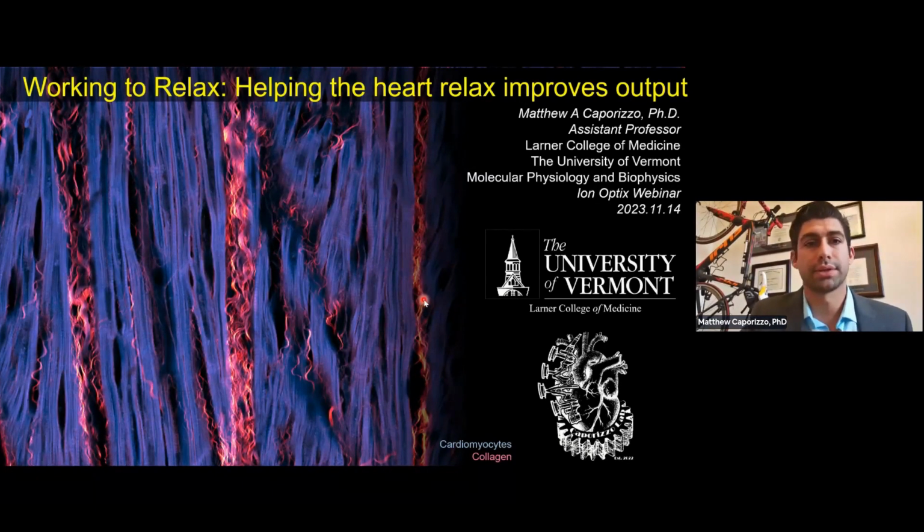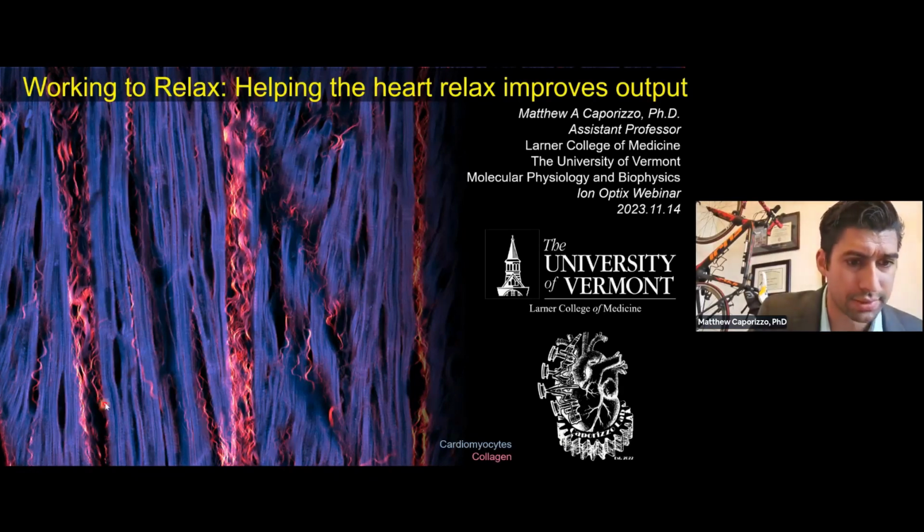Brad gave us a nice introduction to systolic function and the Frank-Starling mechanism. My research really focuses on the other end of that. So we're interested in how the heart muscle relaxes and how this improves cardiac output by improving diastolic function. And the SLICE platform has been really instrumental in helping us to look at the effect of colchicine there.